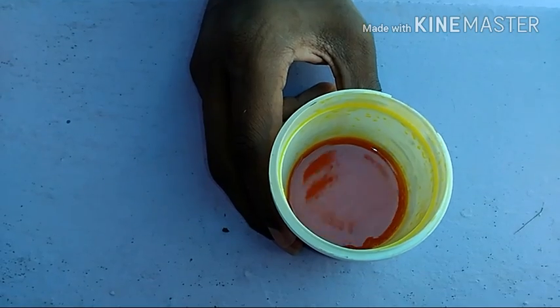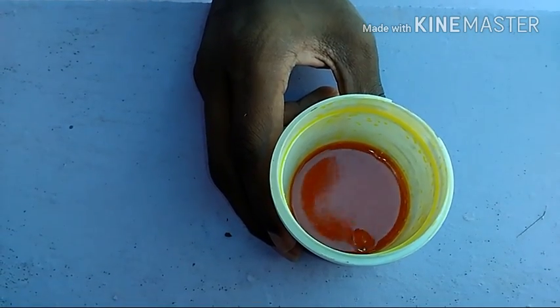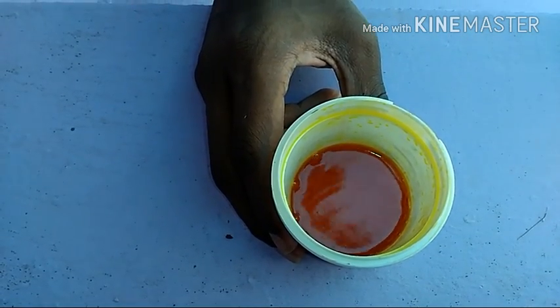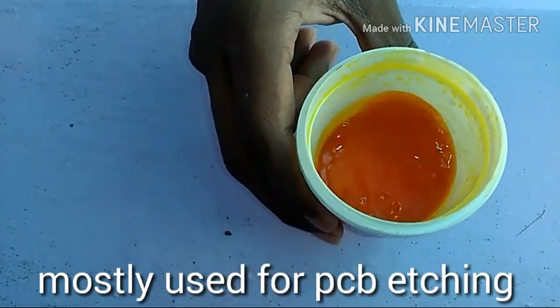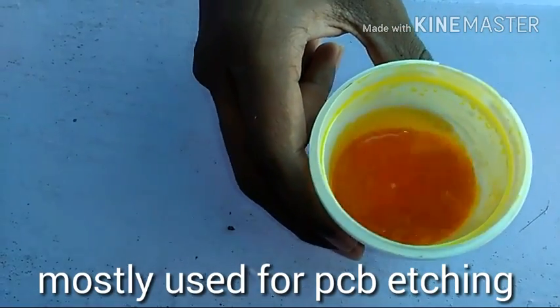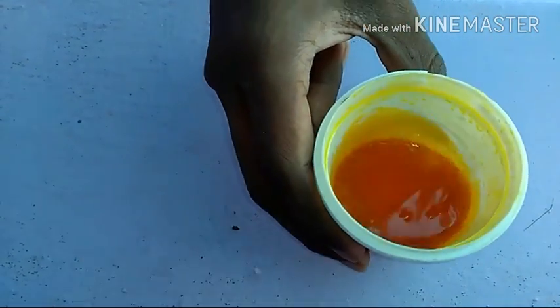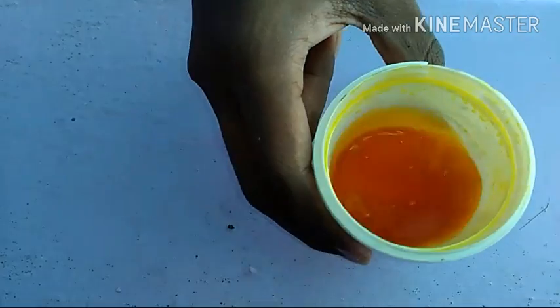Ferric chloride is mostly used by electronics hobbyists for etching of PCBs. Ferric chloride etches the copper present in the copper clad board and clearly forms the circuit board for making circuits.